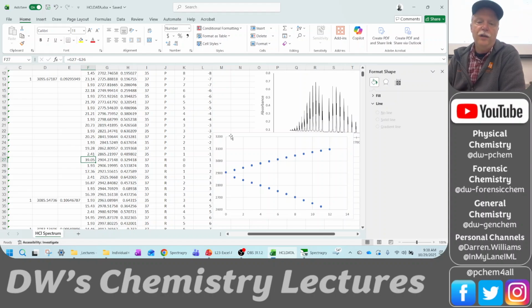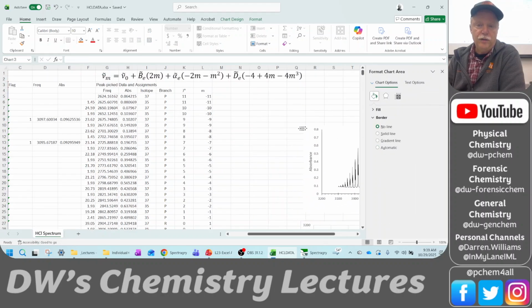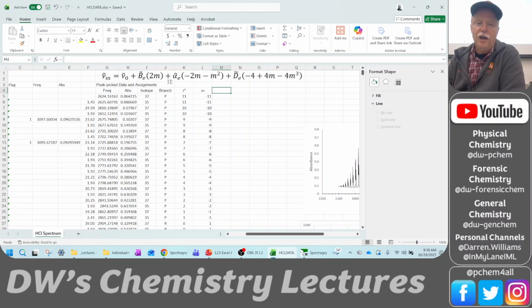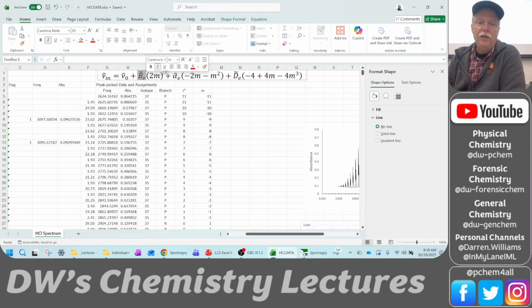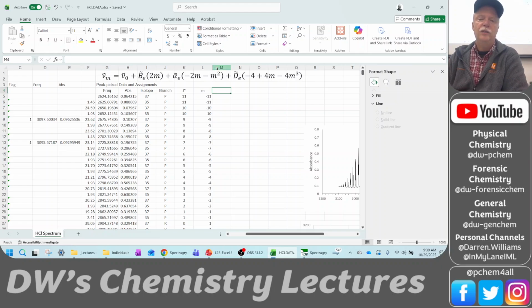Okay, so this is great. Okay, I'm going to scoot this over. And now we're going to make our regression columns. You see the coefficients are what we want. We want nu 0, we want BE, we want alpha E, and we want DE. Okay, and so when we do a regression, we want those to be a coefficient of our columns. And so we have to make columns that correspond to what's in parentheses here.